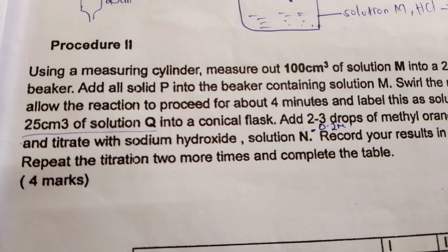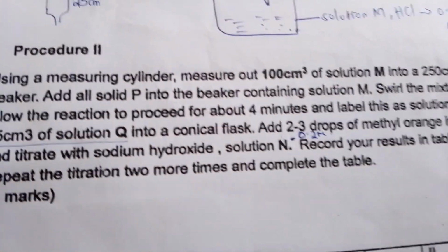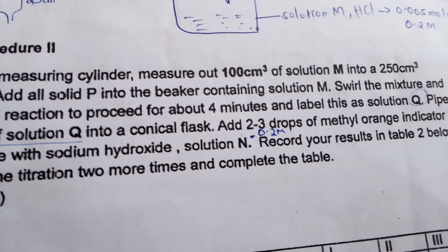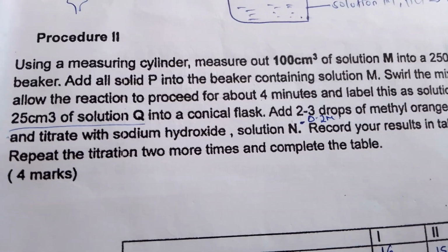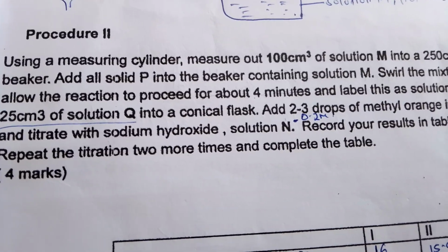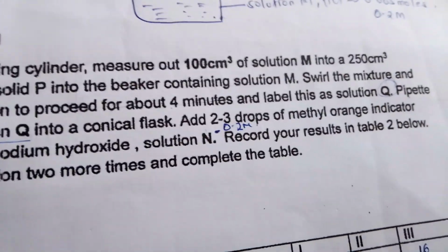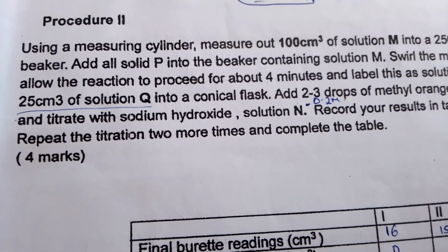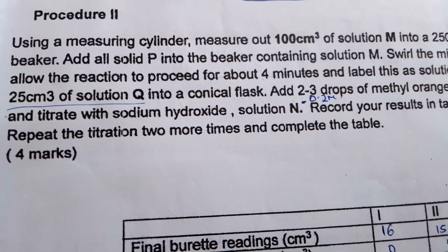Add all solid P into the beaker containing solution M. Swirl the mixture and allow the reaction to proceed for about 4 minutes and label this solution Q. Pipette 25 cubic centimeters of solution Q into a conical flask.